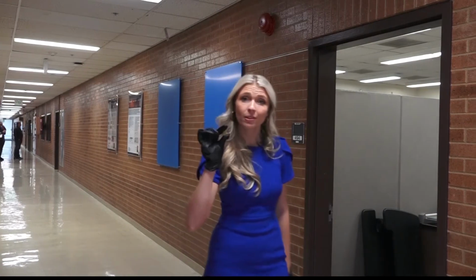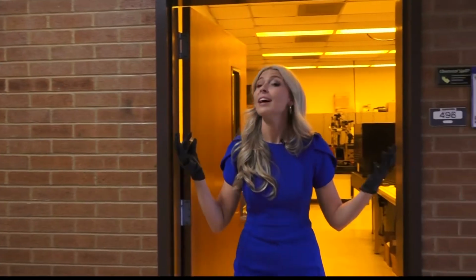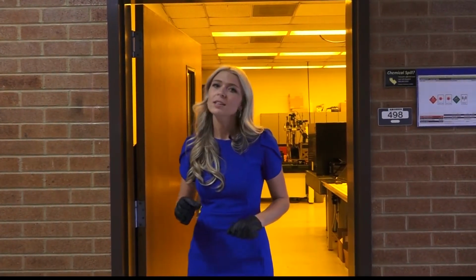When most people think of a lab, they think of people in white lab coats and a big room. But because of the new technologies at BYU, a lab can be smaller than a grain of rice. So come with me into the lab where the light is yellow to make these unique chips.